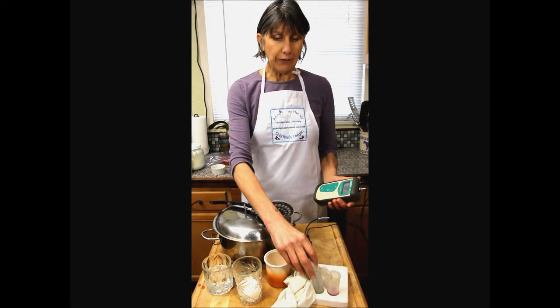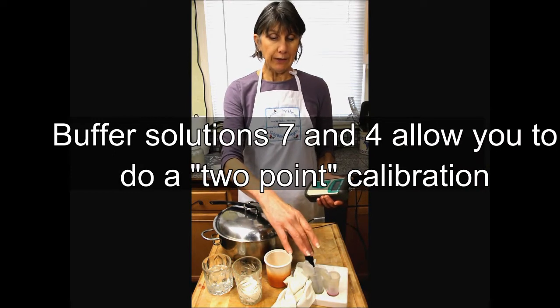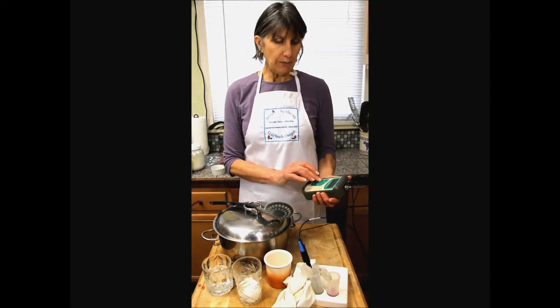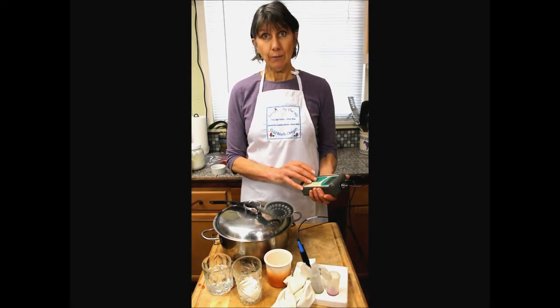So this meter I have soaking in some 7 solution. You're going to have 2 types of buffer solution, 7 and a 4 pH. 7 is where I store my pH electrode all the time. So it needs calibrating usually several times throughout the cheese making day. Each pH meter is going to calibrate differently, so you're going to want to read the instructions that came with it.